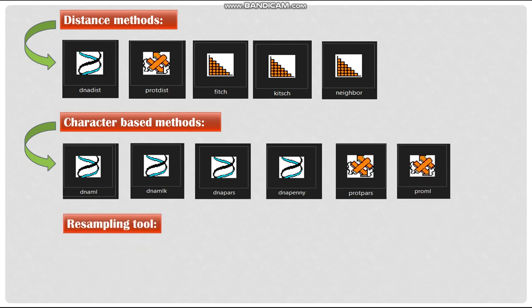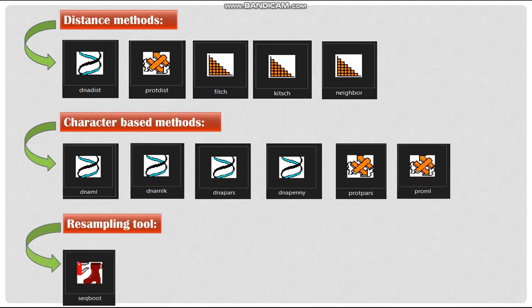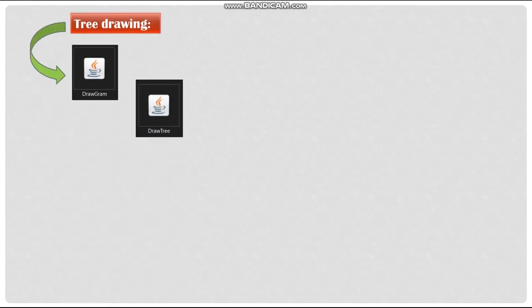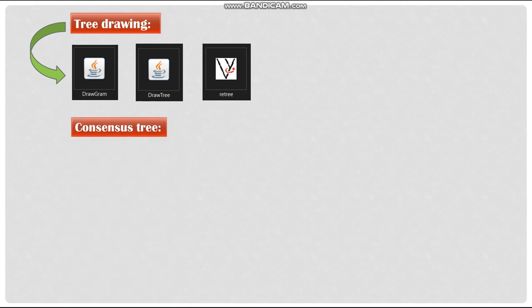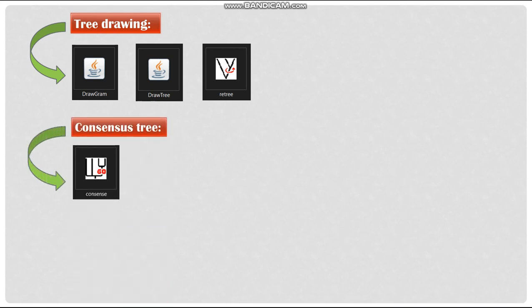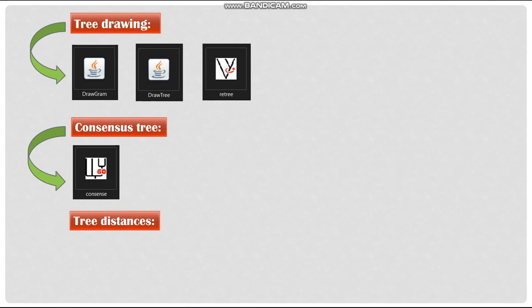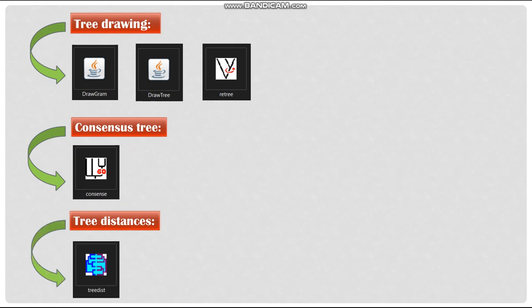In resampling tool, we have SeqBoot. For tree drawing, we have Drawgram, DrawTree and RetTree. For consensus tree, we have Consensus Program. To calculate tree distances, we have TreeDist.